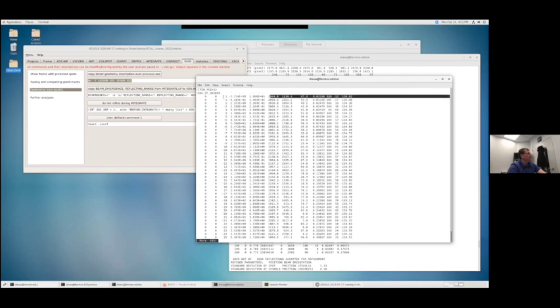In this case, it actually orders them based on their indices, and it will group them such that you have 0, 0, 1, and then it's the negative value 0, 0, negative 1, and so on. So symmetry equivalent, and then Bijvoet pairs next, and then it moves on through there. And so generally, the XDS_ASCII.hkl is what you're going to use in the next step of the data processing.